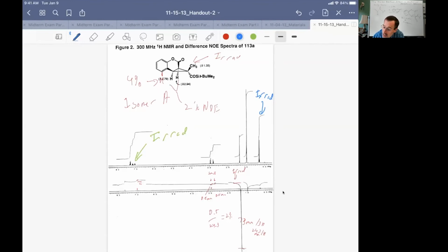Now, with all of these questions, I could have done this either as a set of 1D NOEs, or I could do a NOESY. NOESY is a 2D NOE experiment that would give us all our NOEs at once. They're both valuable. You will get both of them in the homework.